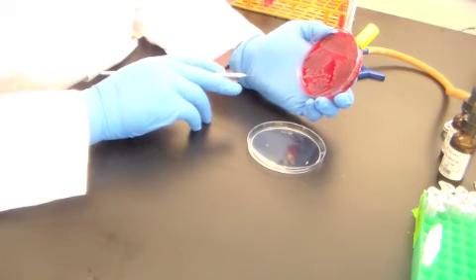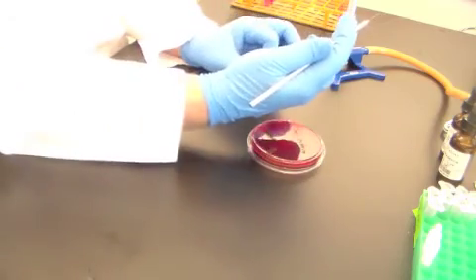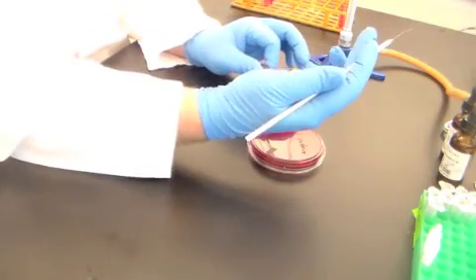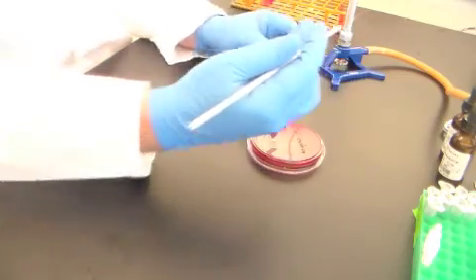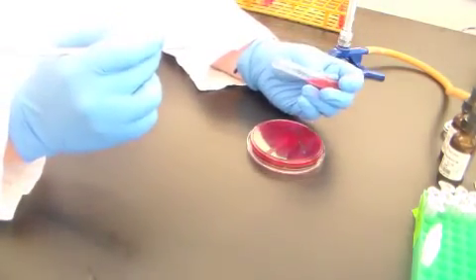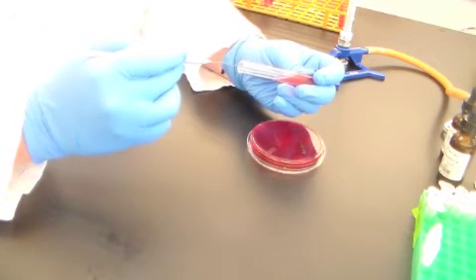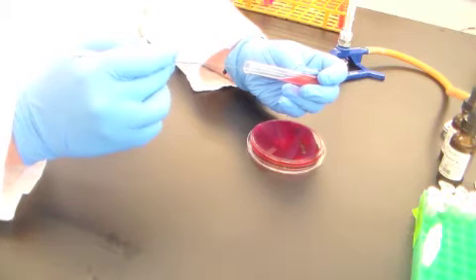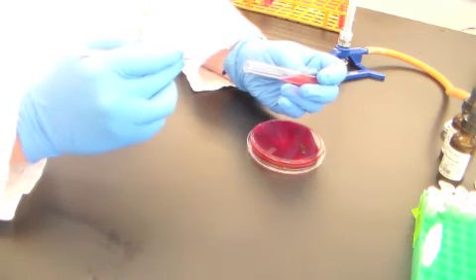I'm going to take my sterile loop and I'm just going to touch one colony, close that. Remember, the good technique is I never set that cap down. I keep it in the pinky of my finger. Pass that through the flame. And now what I'm going to do with shaky hands is to rub that back and forth across the entire surface of that slant a couple of times.